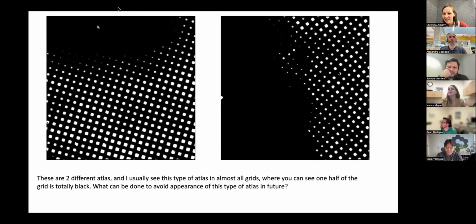Yeah, the grid for me is good. The only thing, like you said, the tweezer could be a little bit down, and you can see on the left side that it's exactly where the tweezer are because it's broken a little bit. And then all the rest is with a liquid that cannot go out from the pad. But the squares look great. At least in this magnification, I cannot see inside the square, but yeah, looks great.